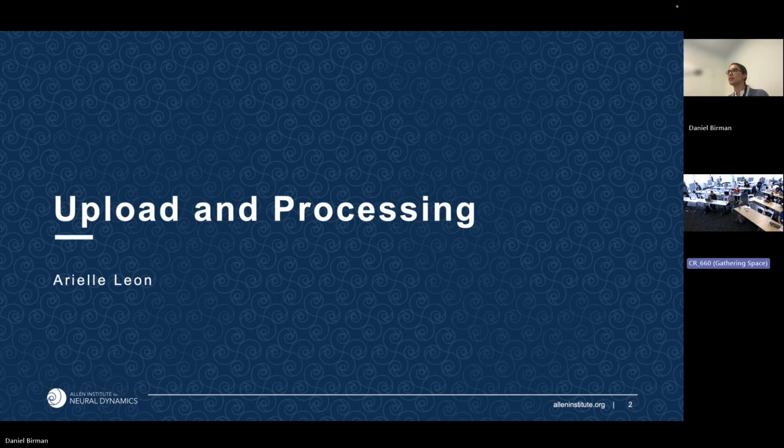So I'm going to be talking mostly about uploading and processing data. I work in scientific computing and I manage the physiology and behavior data team, where we're really excited about gathering metadata for physiology and behavior data sessions, as well as processing them, QCing them, and packaging them into NWB.